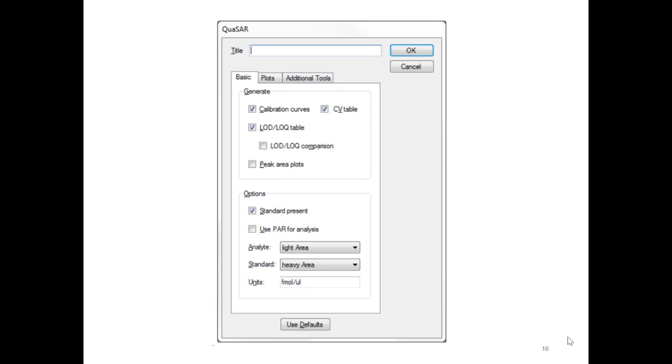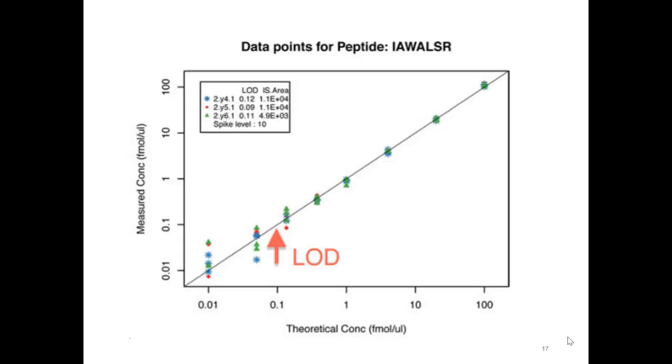I think one of the important options here is that the Quasar model works best when standards are present. So if you don't have internal standards, I'm not entirely sure if Quasar will work for you. If you do have heavy standards, I think Quasar is probably a pretty rigorous model for you to use. It'll work. The only component that won't work is AuDIT. What is required for AuDIT is internal standards and at least 3 replicates per concentration. Yeah, and AuDIT will report out anything that has too high a CV.